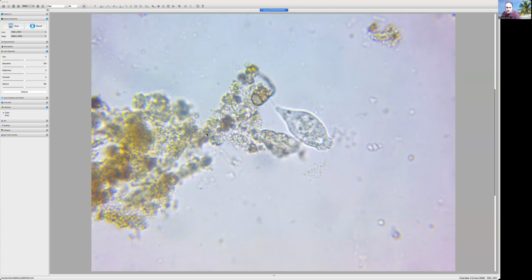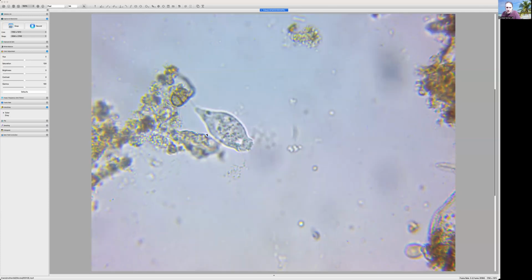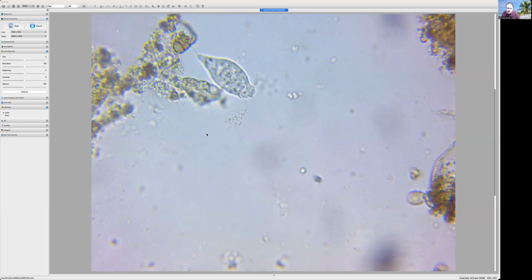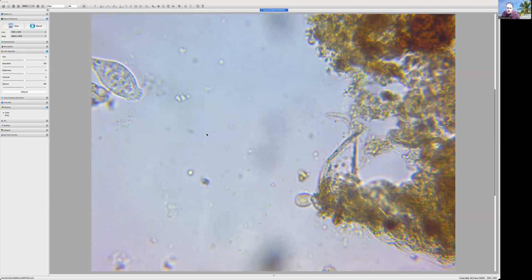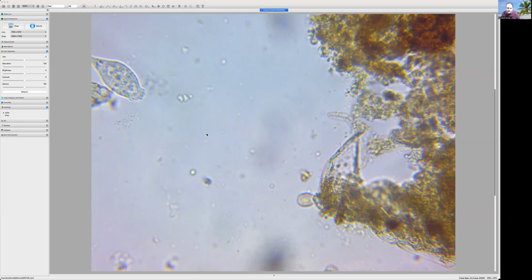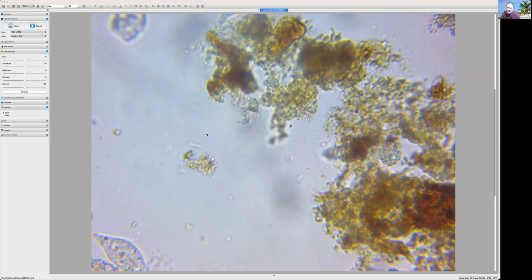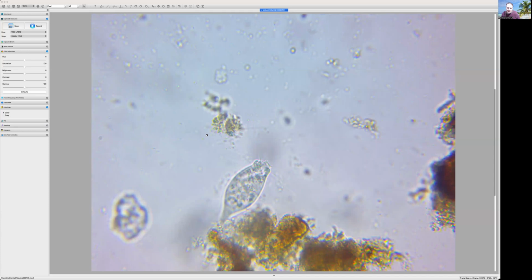Here she is. She's got this vortex here she's created with that water. And she's pulling the bacteria in and it's going out on past there. Looks like she's happy setting up shop there. See all the flagellates around this big aggregate here on the right hand side. And that's silly. It is causing all kinds of whirlwind. Look at this one here. Vroom, vroom.